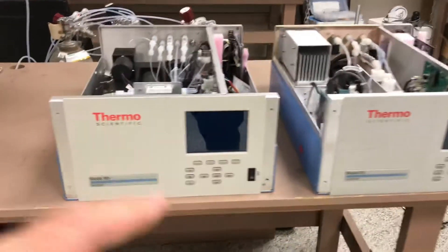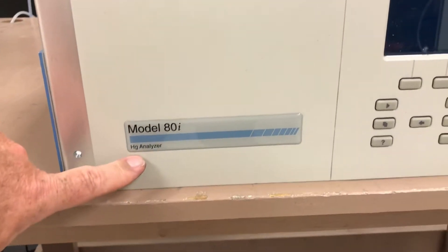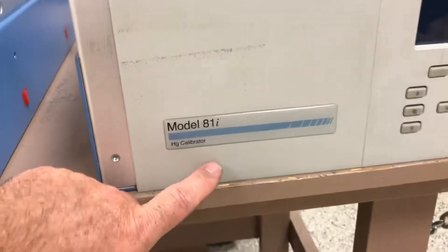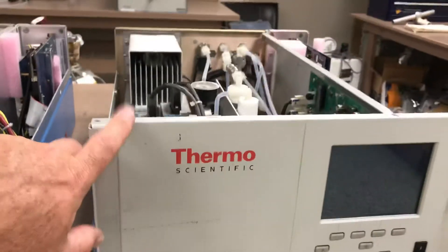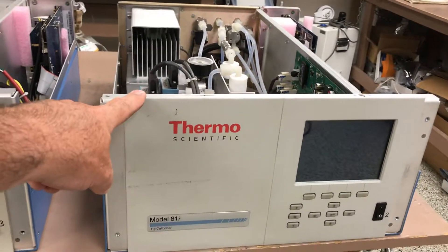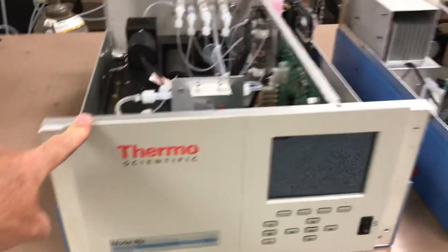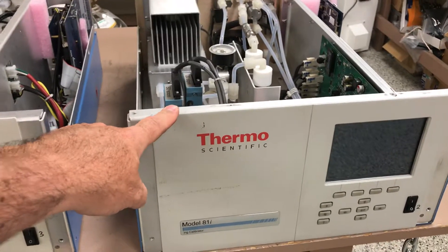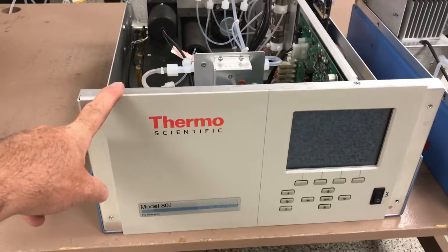On the left is the Mercury Analyzer, 80i, and on the right is the Mercury Calibrator, 81i. This calibrator will do a daily generation of mercury vapor to span check the analyzer. It typically generates about 10 micrograms per cubic meter of mercury and then sends it into the analyzer to do a daily span check.